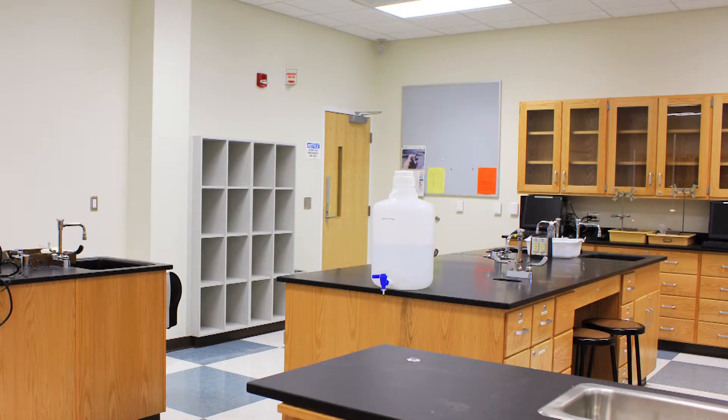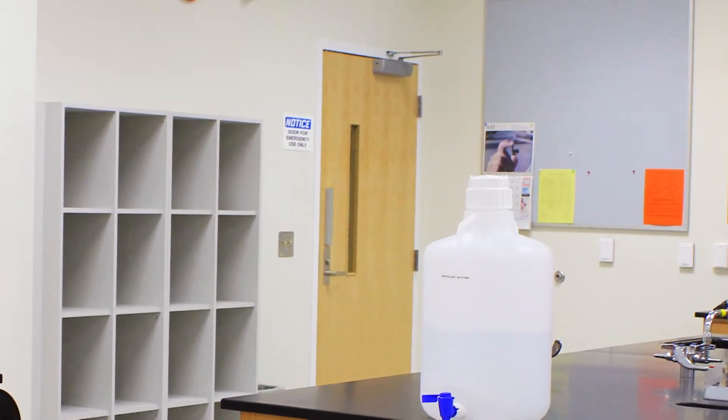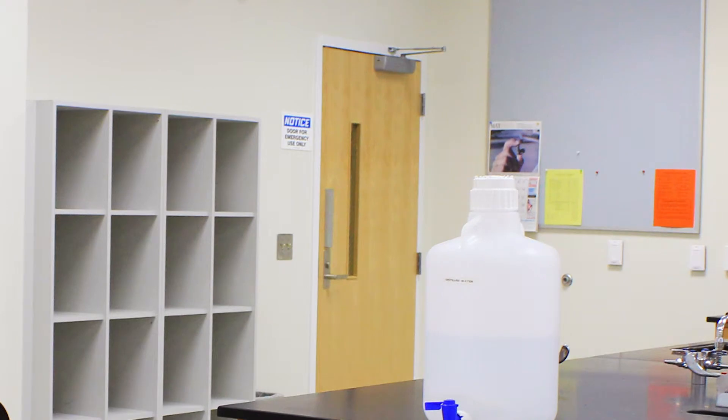Notice the location of the primary exit door. It is next to the coats and book bag storage opposite the door you came in. In the event of a fire, you should first pull the fire alarm and notify your instructor.